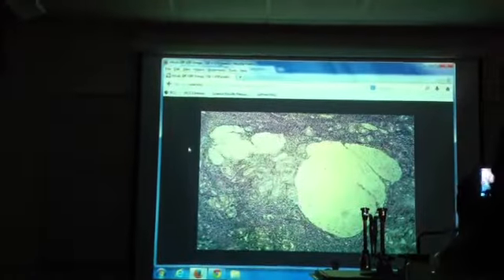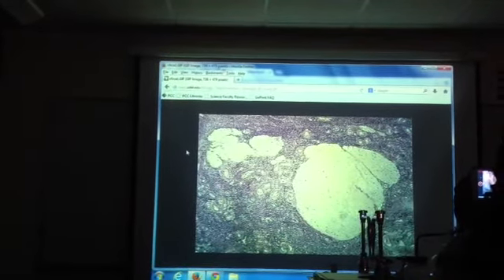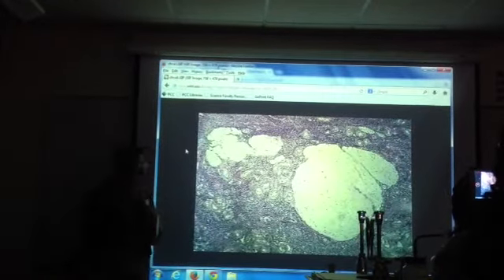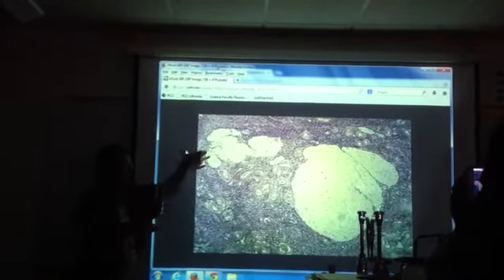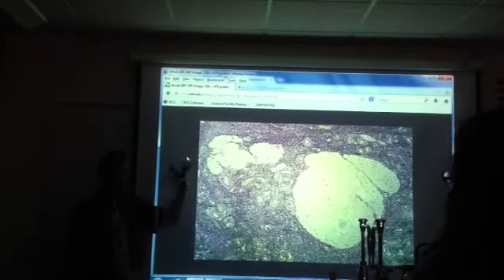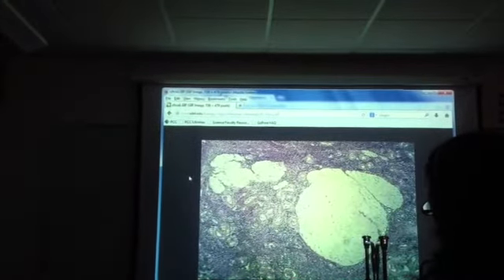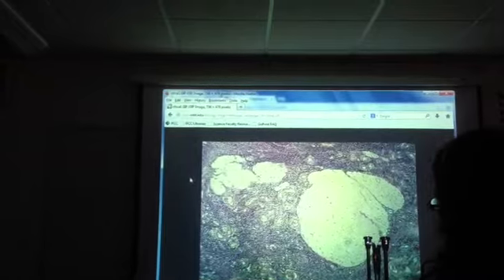So then we're going to do the upper left, compared to the right. Corpus albicans. How'd you know that was an albicans? Because it looks like it's shrinking. Yeah, they're shrinking, right? So the luteum gets smaller and smaller and decays and becomes an albicans. They look kind of the same, just size is different. This one looks a little more destroyed. So that large one on the right is trying to become an albicans. Yeah, so that's a luteum going to become an albicans.